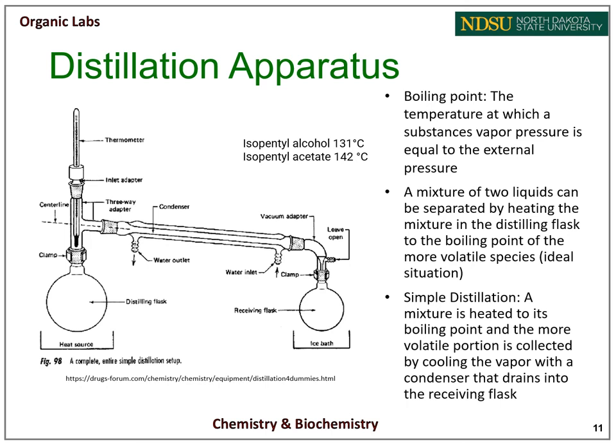For distillations, you'll need a small round bottom to distill from, which will be your distilling flask. That is to be clamped above a heating mantle. This will then be attached to a distillation adapter that you'll have a thermometer attached to. This will monitor the temperature.